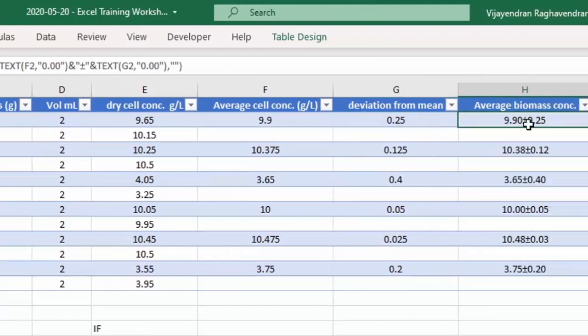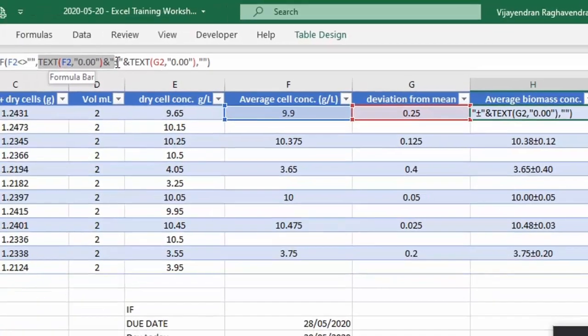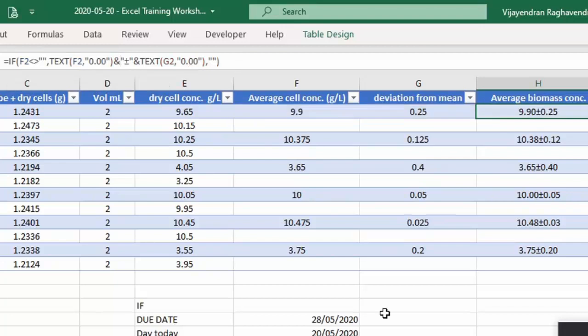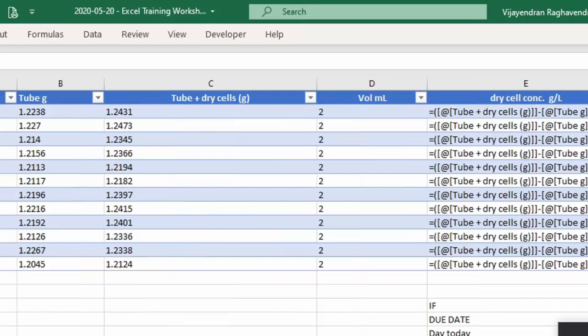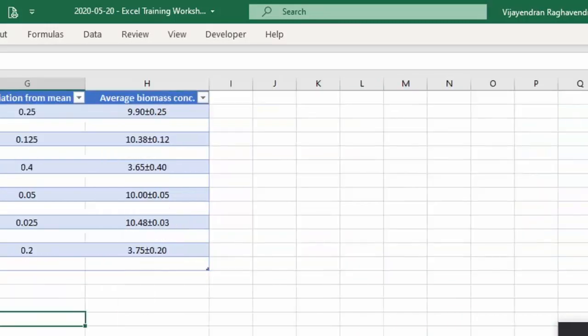And this plus minus, because sometimes you might have seen, rather than you putting the plus minus manually, you can use again Excel's text function, using this concatenate feature, to get these right. So you've got this sheet. I know it's very quick. You can try it using this Control apostrophe on the top left to see what is actually happening in a particular cell.